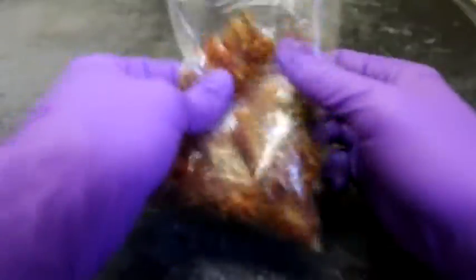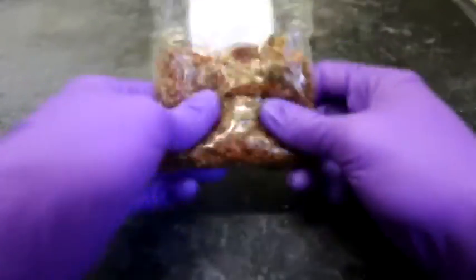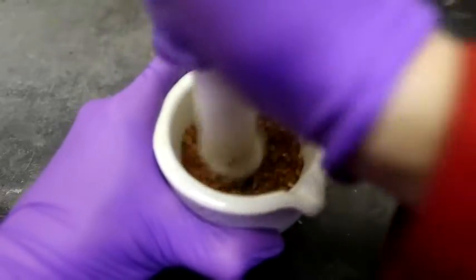Assalamualaikum warahmatullahi wabarakatuh. My name is Wan Azrai Yafi bin Haridin, and today I'll be talking about the methods of using Soxhlet extraction. So the first step to start off is by drying and crushing the sample into powder form using a mortar to provide a greater surface area.